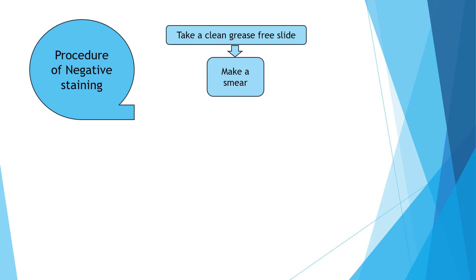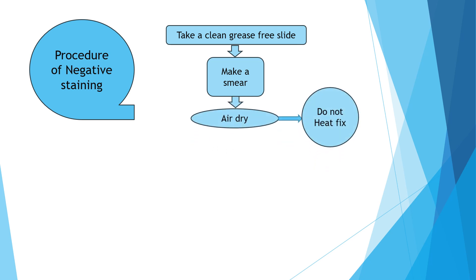Here we use a nichrome wire loop for making a smear, because nichrome is a metal which heats faster as well as cools down faster, helping to save time. After making a smear, we have to air dry the slide. Here, no heat fixation is done.